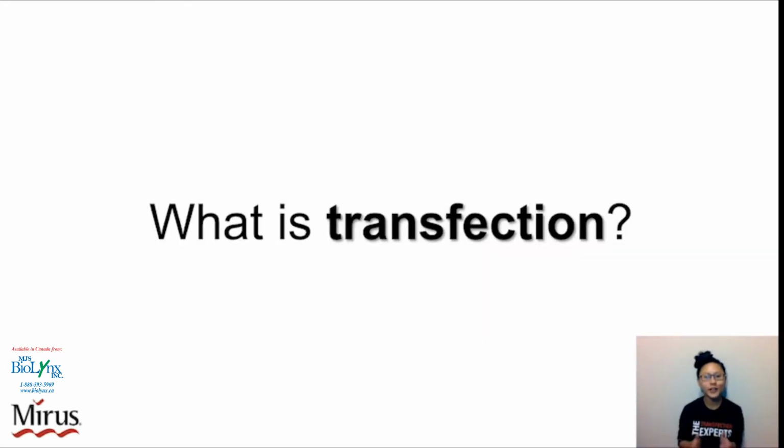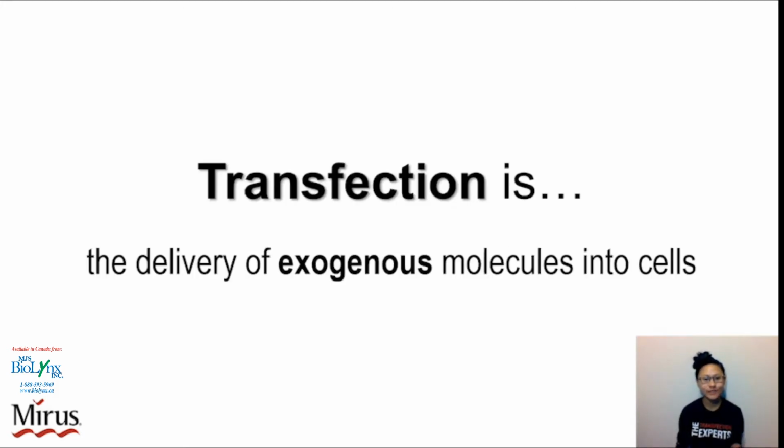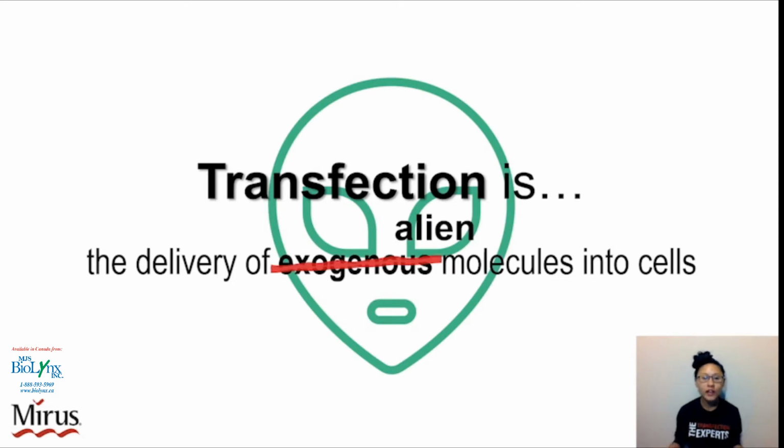Alright, so let's get started. For all of you non-transfection experts out there, let's first define what transfection is. Transfection can be broadly defined as the delivery of exogenous molecules into cells. Another way of putting that is alien or foreign molecules being delivered into cells.